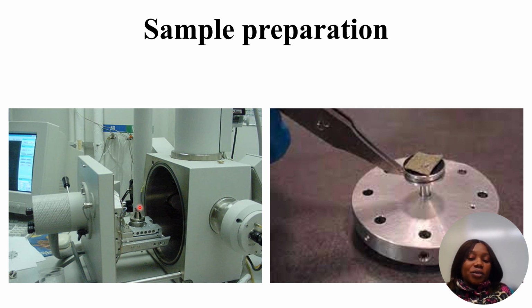And it's important you do this when the vacuum is still open, because if you set the stage and don't allow it to adjust before you close the vacuum, then it could go up so high and crash the detector. So it's very important you do this when the chamber is open, and be sure that you have the stage set well before you close the chamber, and then you can start analyzing your samples.